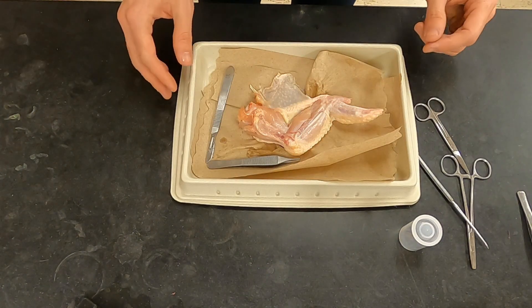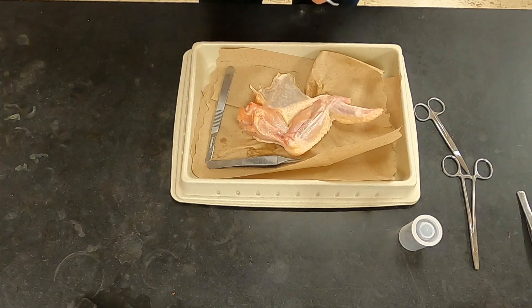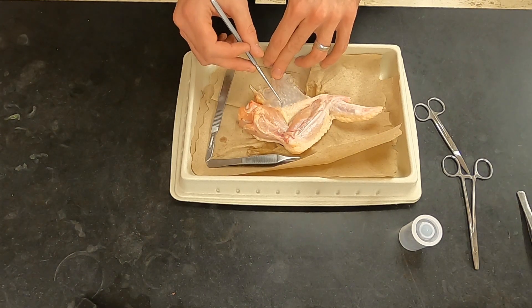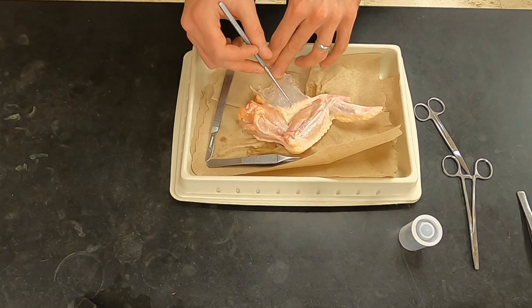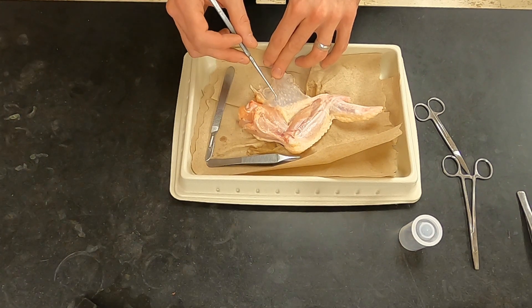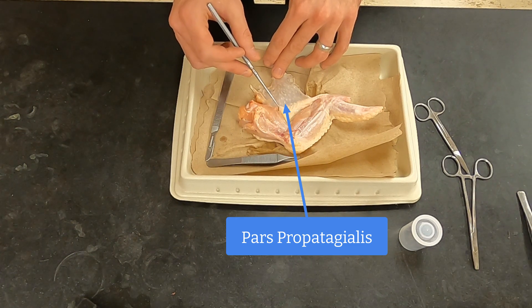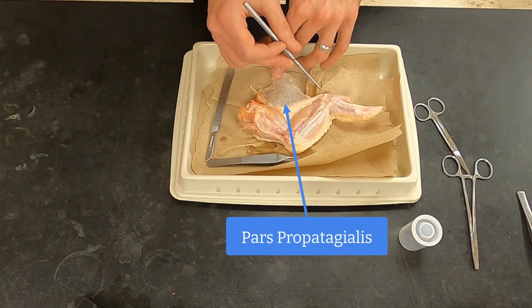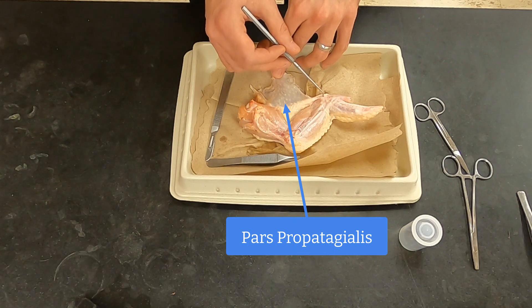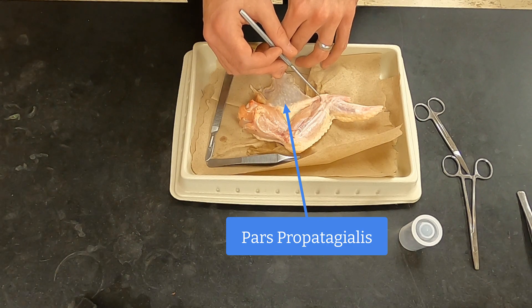Once you get the wing to this point, there are some interesting things to note. This is a muscle and a tendon that support the propatagium, and this muscle and tendon structure is called the pars propatagiális. It's got parts of the bicep and parts of the deltoid, and it connects here to the structure that is analogous to the wrist in the chicken, and it helps to bring the wing in and have better control over the wing.